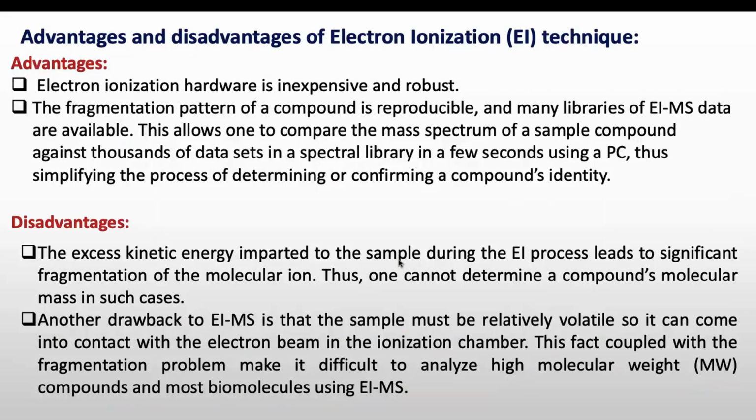This method has several advantages and disadvantages. First, let's see the advantages. Electron ionization hardware is very inexpensive and robust, the fragmentation pattern of a compound is reproducible, and many libraries of EIMS data are already available. This allows one to compare the mass spectrum of a sample compound against thousands of data sets in a spectral library in a few seconds using a computer, thus simplifying the process of determining or confirming a compound's identity or its molecular weight.